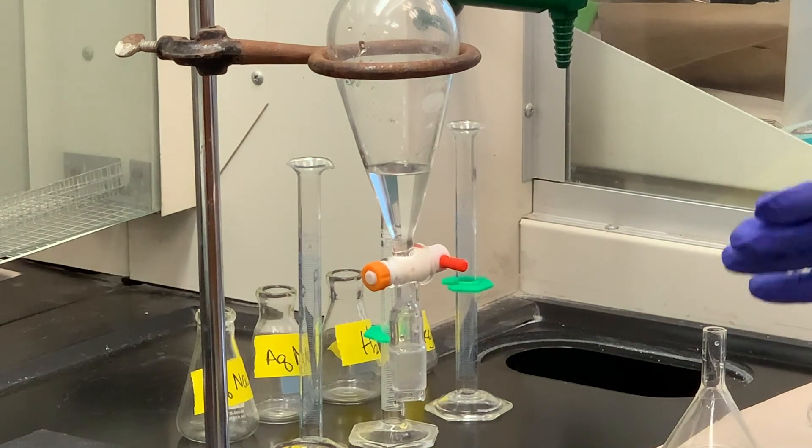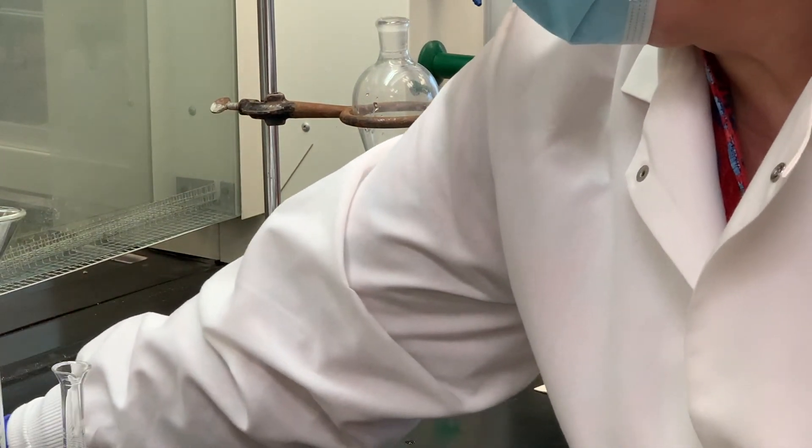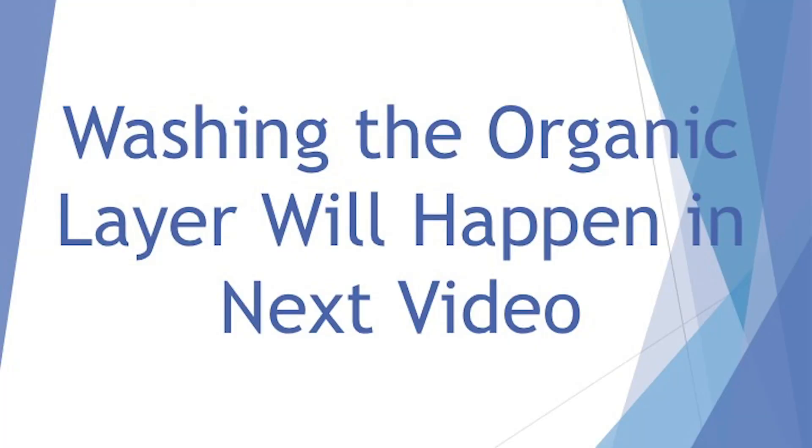And again, never throw any fraction away that you're collecting. I'm just going to push that to the back. I'm going to drain this.